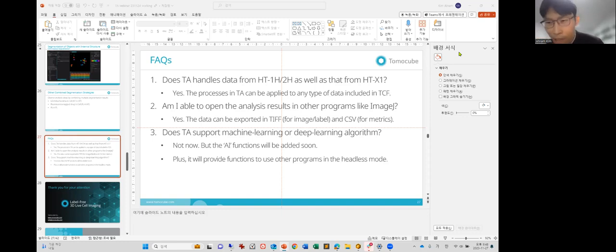Yeah, Ahram, please just move on to Hussein's other question. This is about the lipid droplet analysis. Okay.